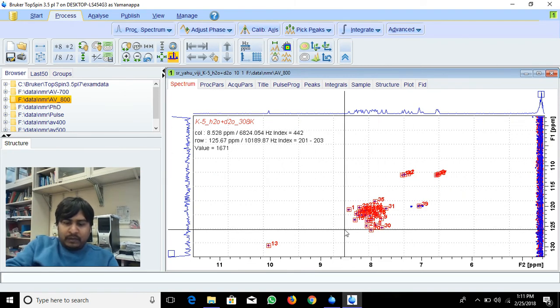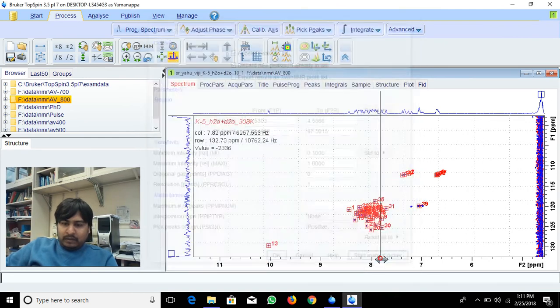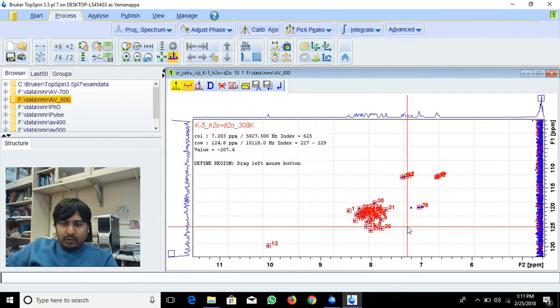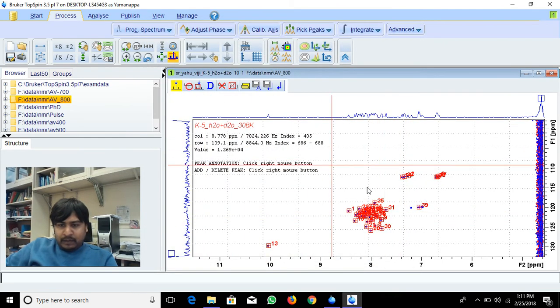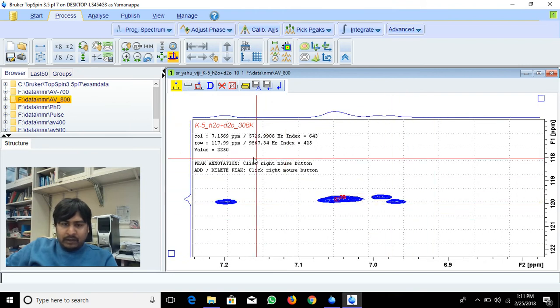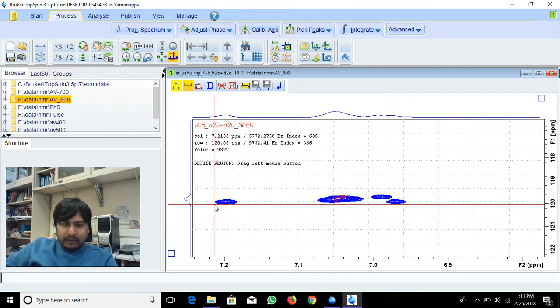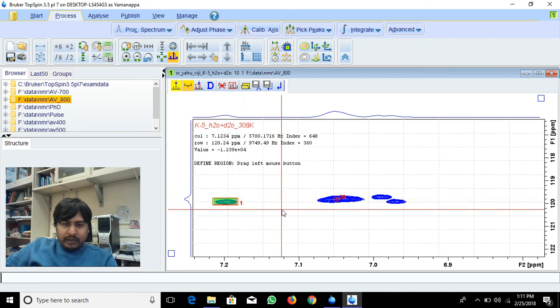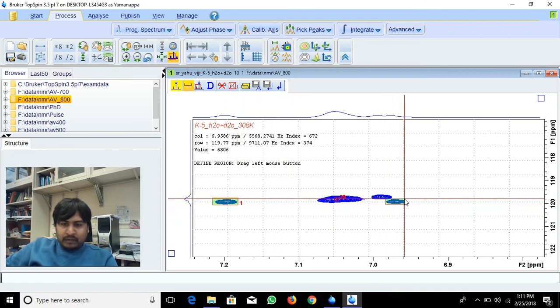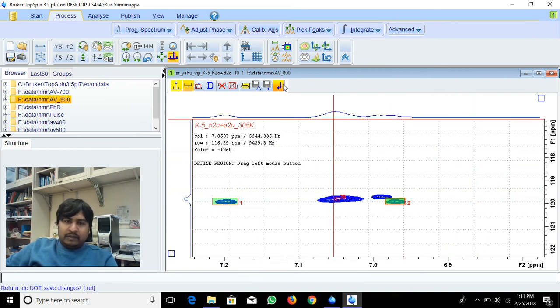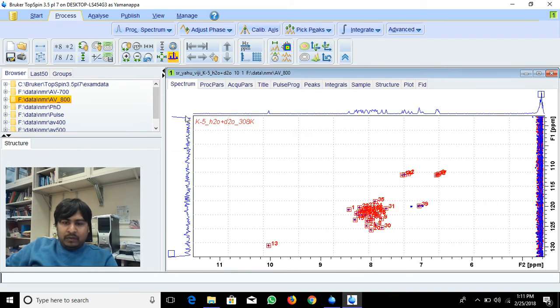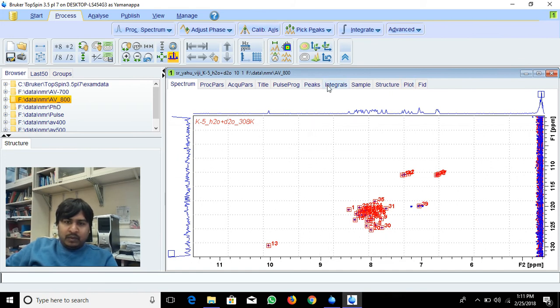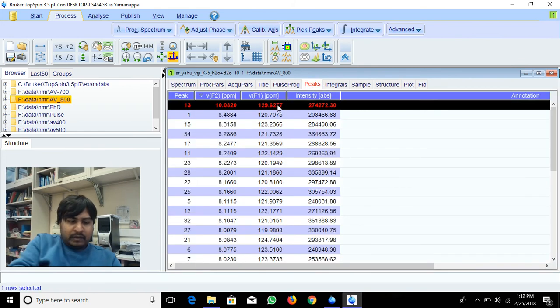Again it will go to manual peak picking. See here, if it's not picked here, you can select this as another peak. Again you can select these peaks like this. You can do like this to pick peaks in two-dimensional NMR spectrum.